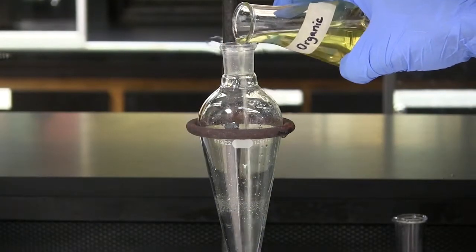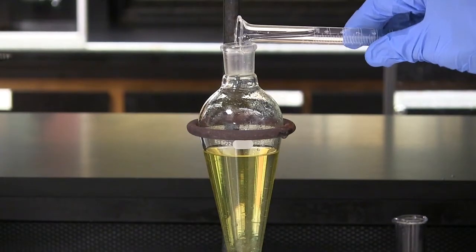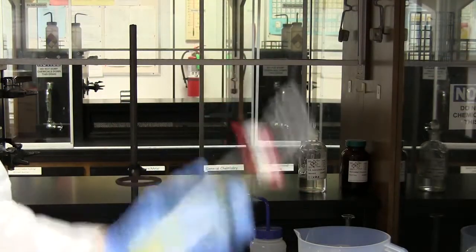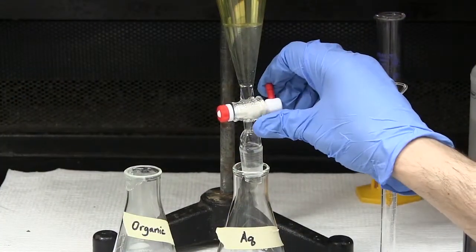Put the ether layer back into the separatory funnel. Extract it with 3 10 milliliter portions of 1 molar sodium hydroxide. Again, vent the funnel frequently, especially with the first extraction. Combine all of the aqueous extracts.